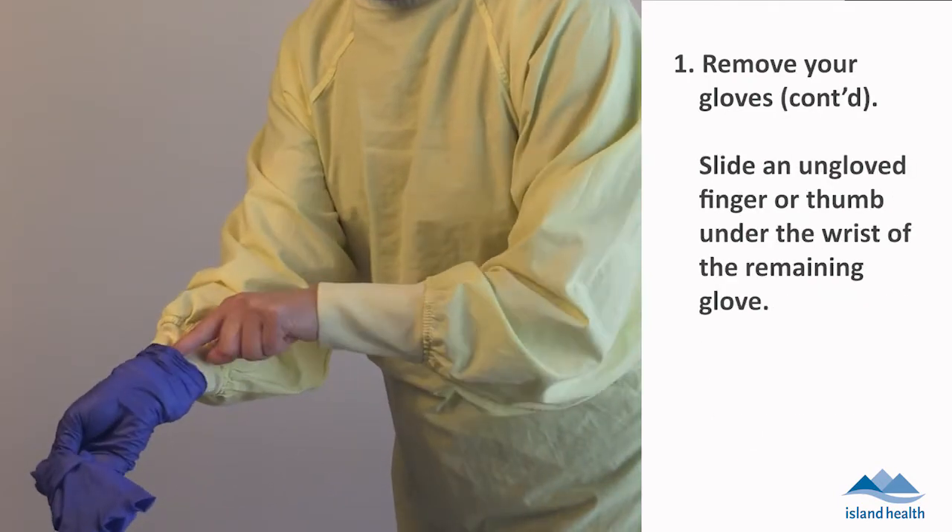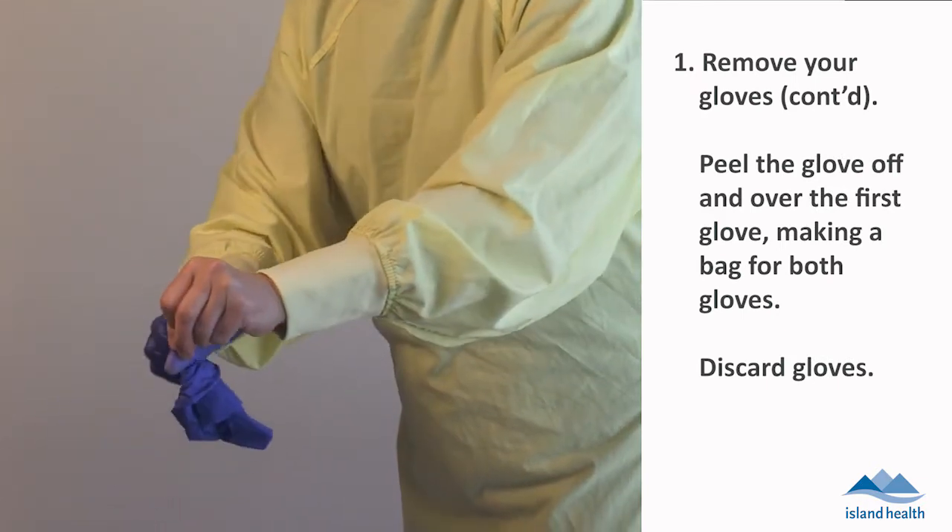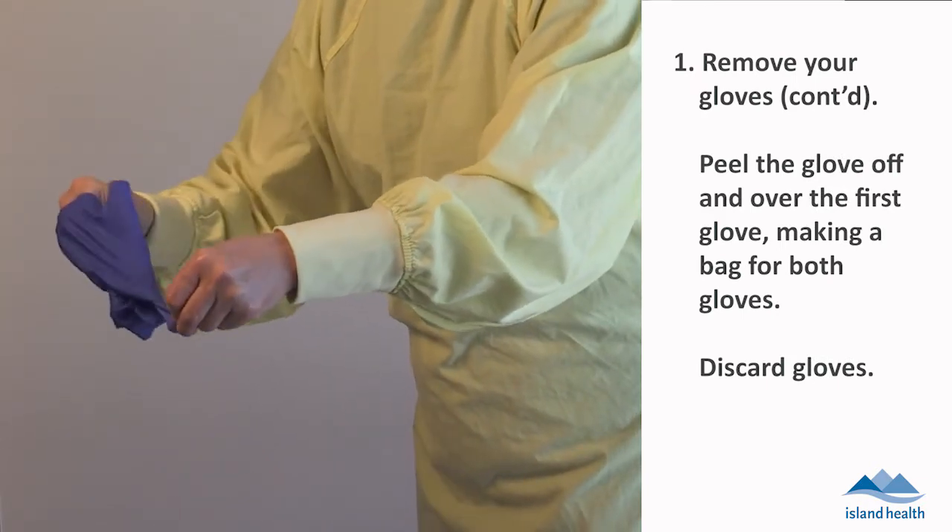Slide an ungloved finger or thumb under the wrist of the remaining glove. Peel the glove off and over the first glove, making a bag for both gloves. Discard gloves.